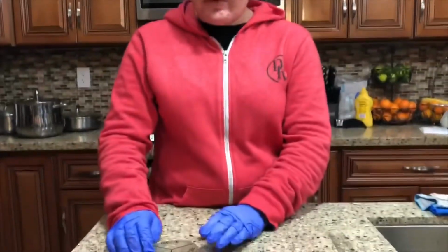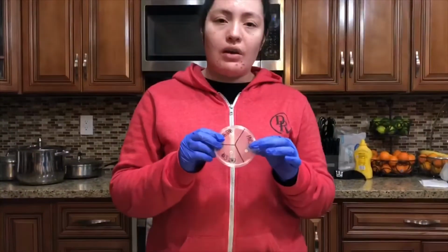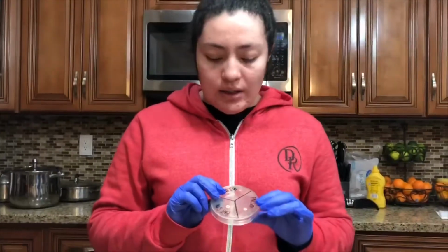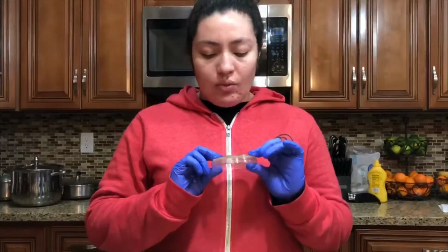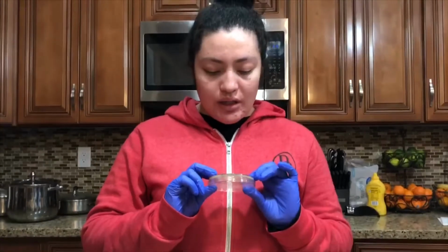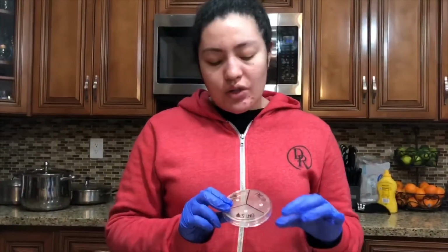So a little refresher, this experiment was done 24 hours ago. So I actually let it incubate for 12 hours and I tried to see any bacterial growth. Didn't see any, so I waited an additional 12 hours, so it was a total of 24 hours. And I noticed that there was bacterial growth, and you can actually see the zone of inhibition in all 3 of the antibiotics.